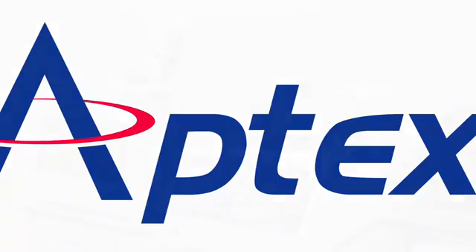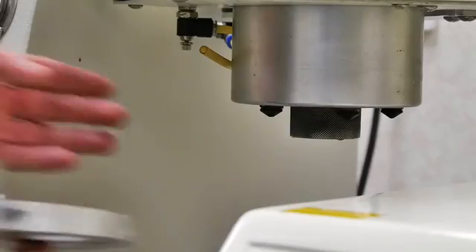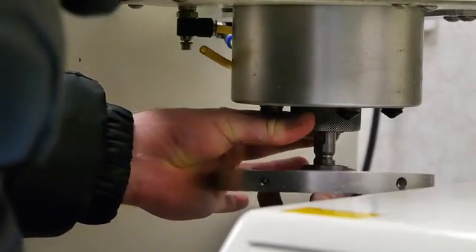Today we are demonstrating how to use the TopTek Plato R Series Semi-Automatic Grinder Polisher to prepare printed circuit board sections. There are interchangeable heads available for 25, 30 and 40mm samples.